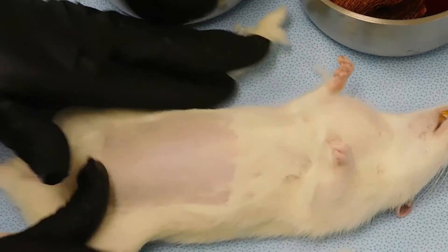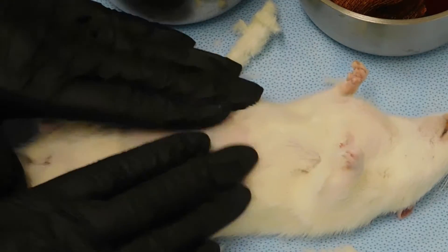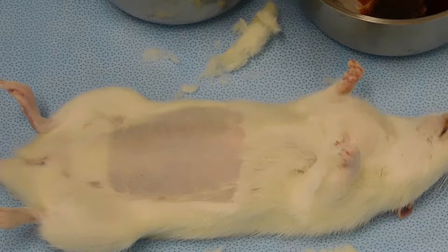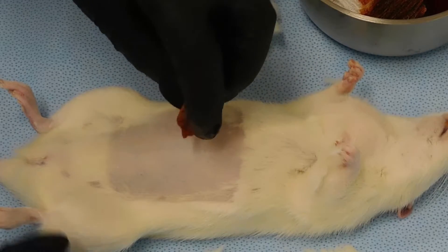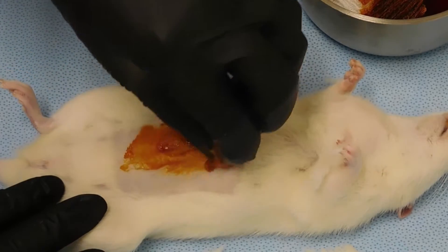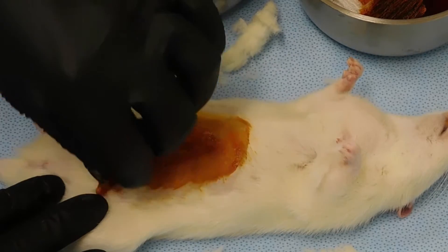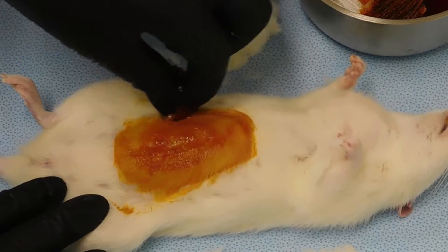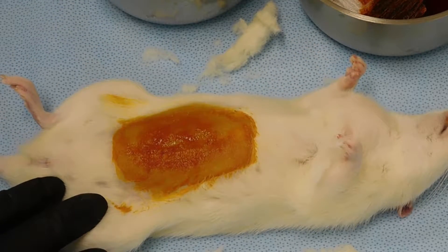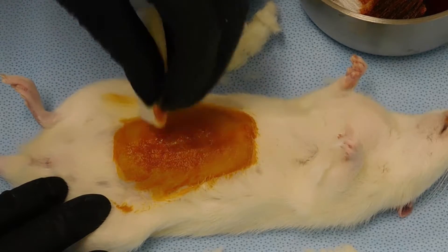Disinfect the shaved area by alternating three applications of a surgical scrub and 70% isopropyl alcohol. Start by placing a sterile gauze square dipped in the scrub solution at the center of the clipped area. Scrub the skin from the center outward using a circular motion.